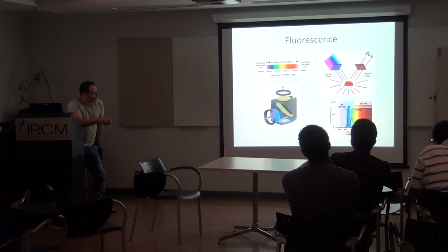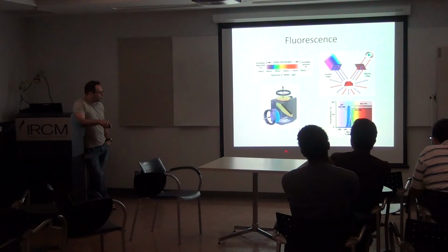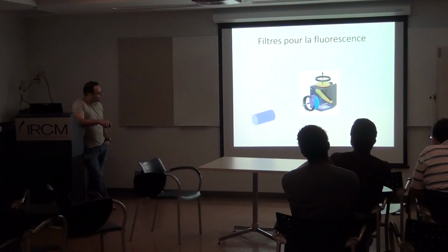The dichroic will not transmit light below a certain wavelength and will transmit light above that wavelength. So if the blue arrives here, it does not transmit light at all. If it's not transmitted, it's going to be reflected. It's going to go down to your specimen, like this.